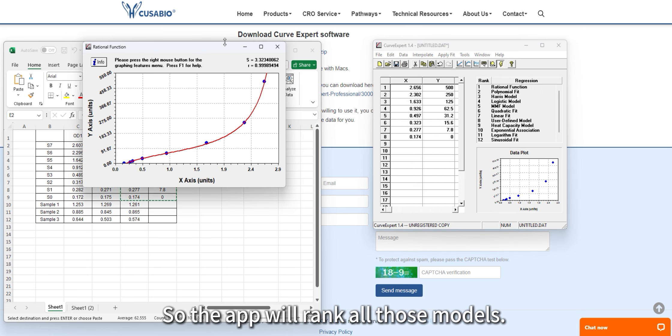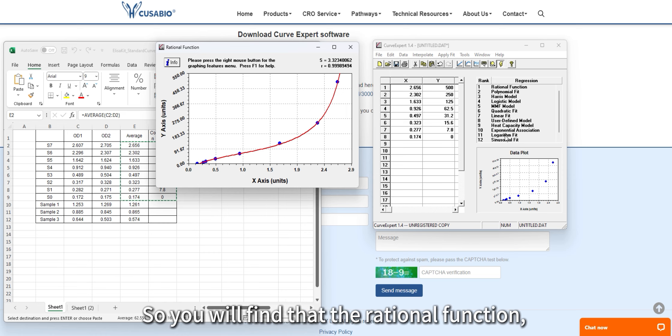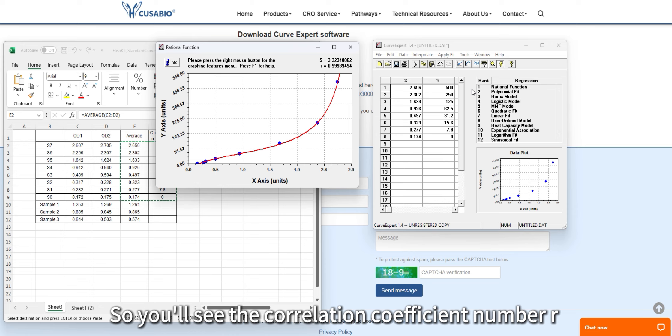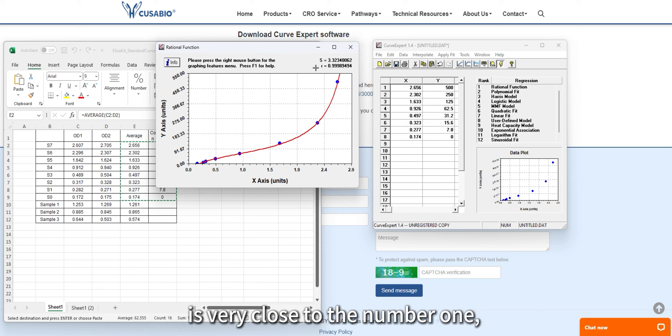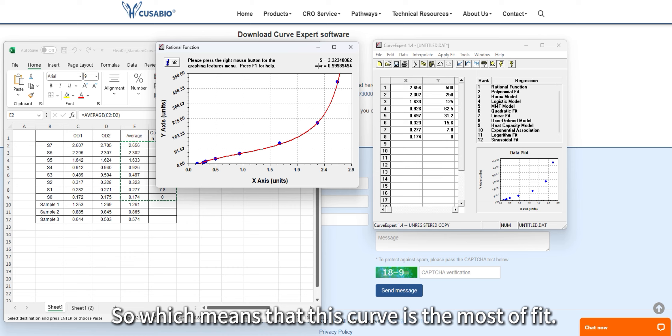The app will rank all the models. You will find that the rational function is the top one, which means it is the best fit for the datasets. You will see the correlation coefficient R is very close to one, and the standard deviation is only three, which means this curve is the best fit.